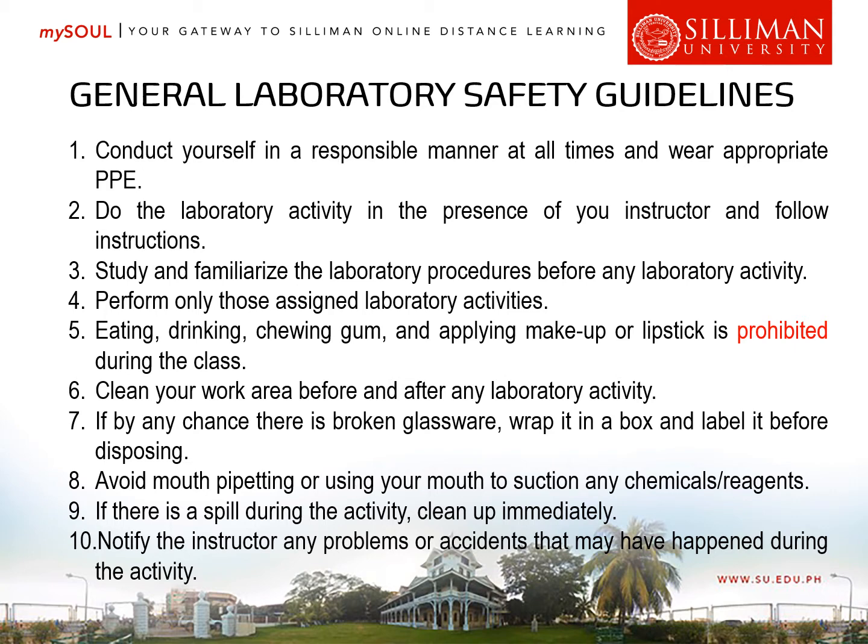Number two, do the laboratory activity in the presence of your instructor and follow instructions, especially if you do not know the procedure very well. It is required that you be trained under the supervision of a head medical technologist because they will guide you on what to do or what not to do when working in the section.